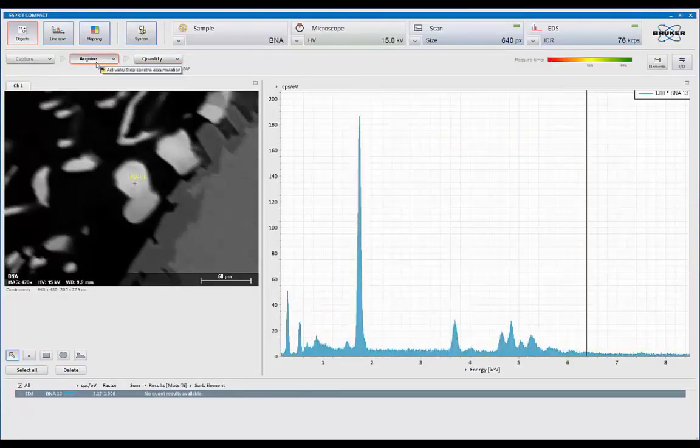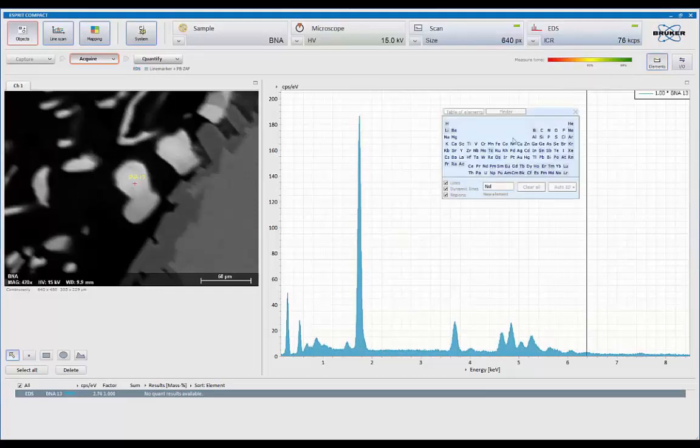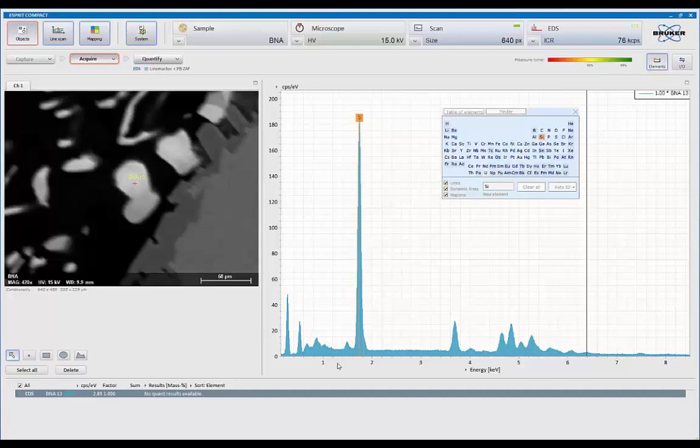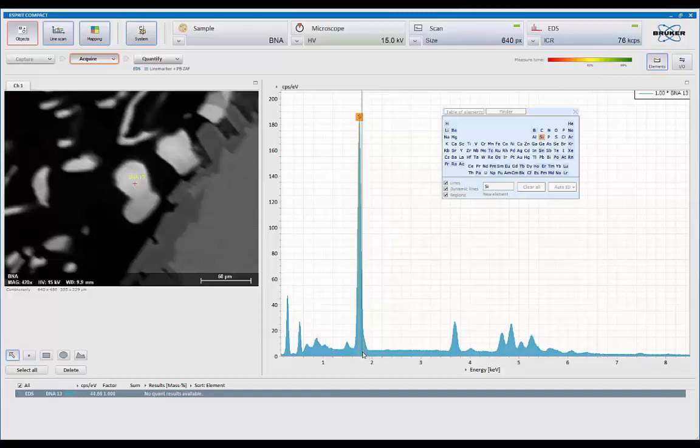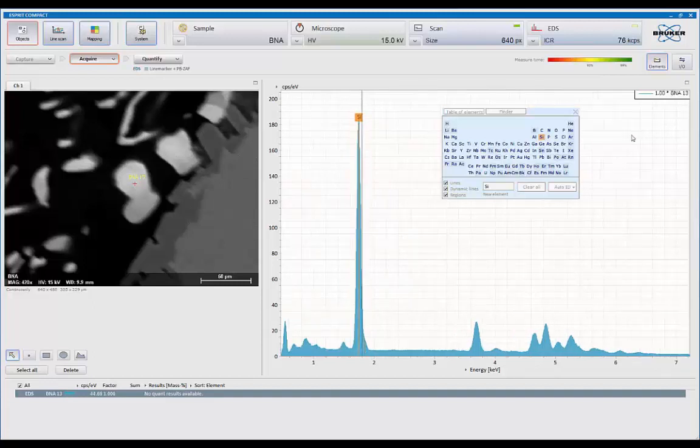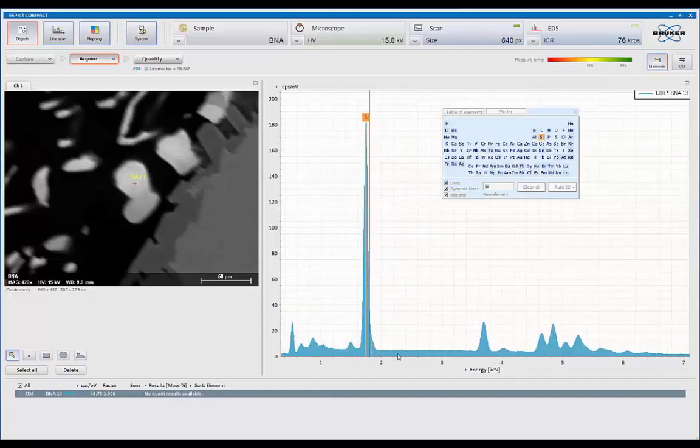For identification purposes, utilizing the periodic table tool, we can simply click on any KLM marker at any time. And notice on the silicon peak, the formation of the little shoulder on the high energy side, that's the formation of the silicon K beta. And right now we're about 76,000 counts a second.